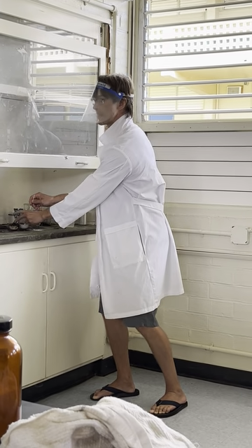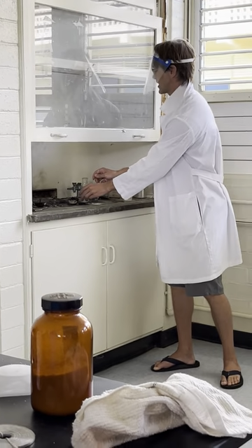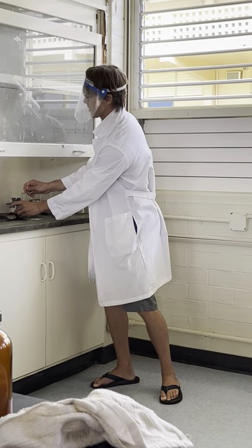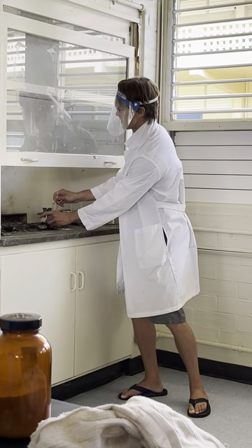So yesterday, by which I mean last week, we saw what happened when we put glycerin on a different strong oxidizer, potassium permanganate. And this is just a slightly different carbohydrate and a slightly different oxidizer.